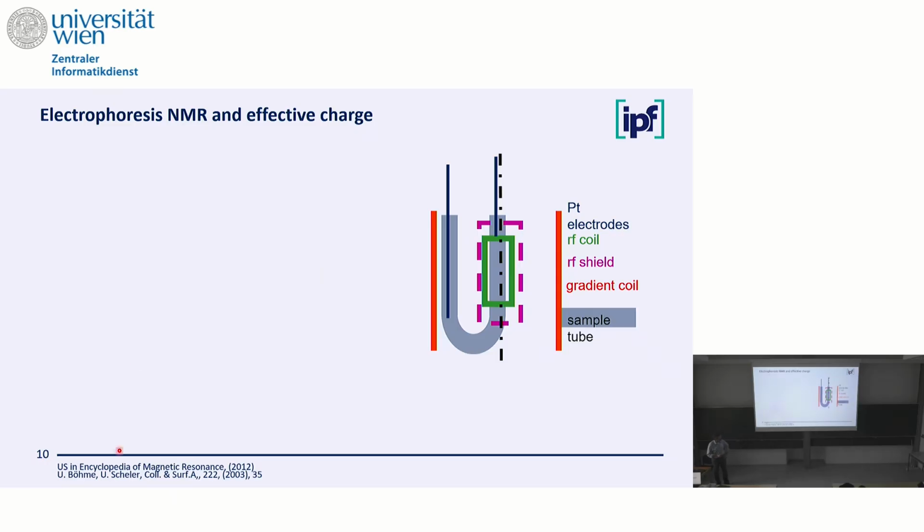I struggled a little bit to get it really adapted to the aqueous system. That is a sketch of our experimental setup. We have this U-shaped tube. We have 2 electrodes inserted there, and I apply up to 1,000 volts. That is not a lot in terms of the electrophoretic motion, but it's a lot for the electrochemistry that can happen. So we have electrolysis of the water.